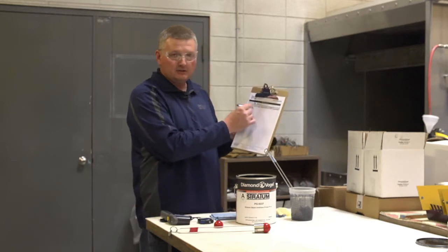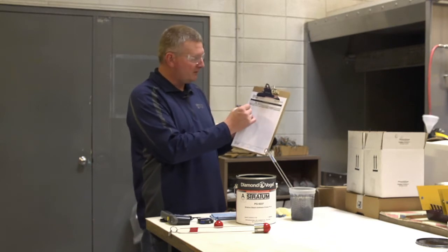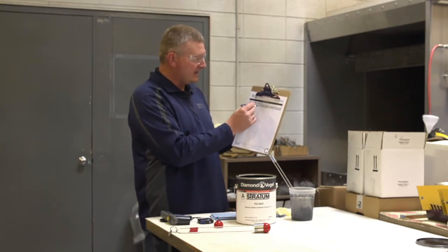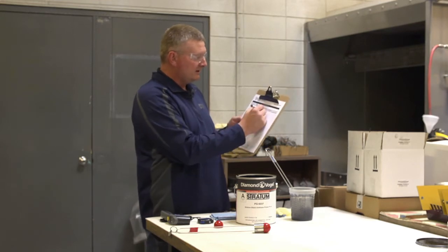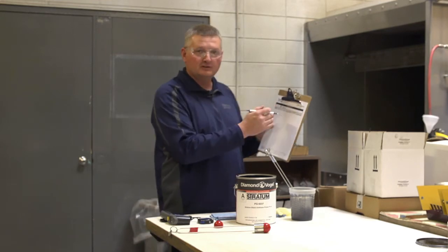First shift, the initials — my initials are MG for Mark Gaskill. Today's date, the temperature: 75 degrees. The initial viscosity was 22 seconds.